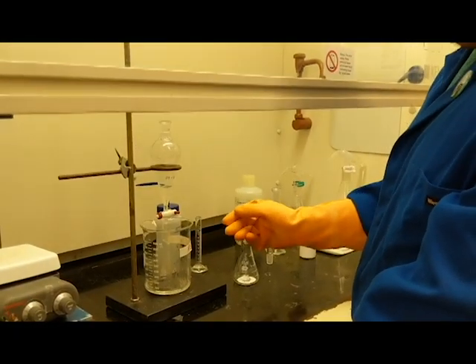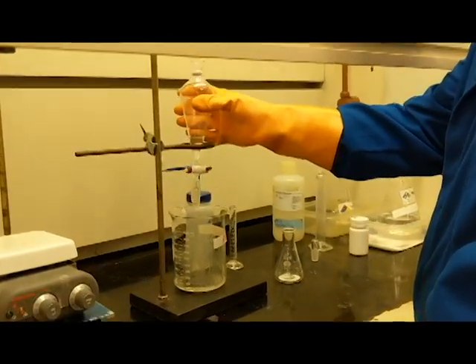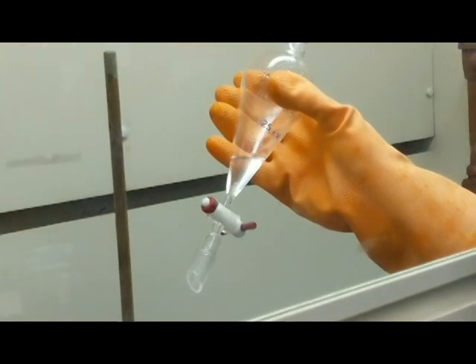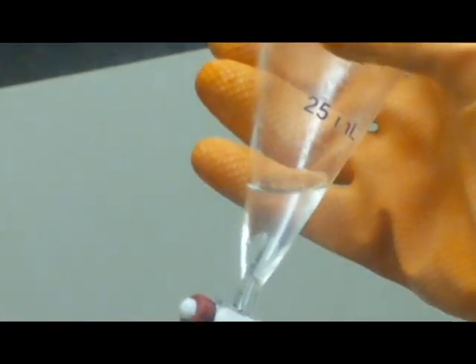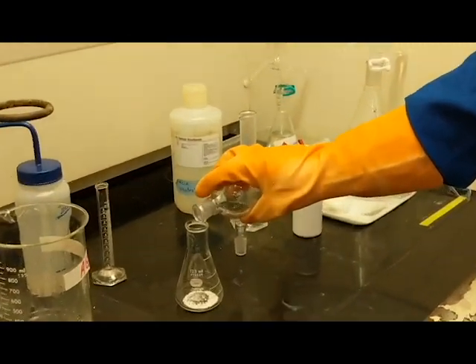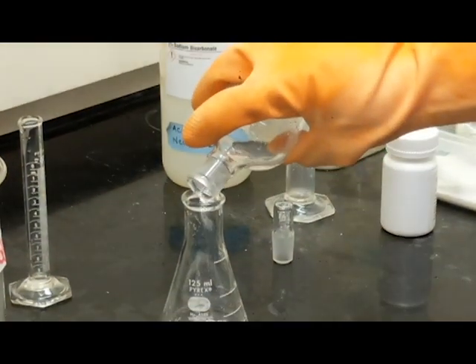By draining it out, we're going to pour it out. And the reason why is because, as you can see, there's some condensation right at the end of the extraction flask. And we don't want that aqueous layer to mix with our final product. So rather, I'll just slowly pour it over the drying agent.